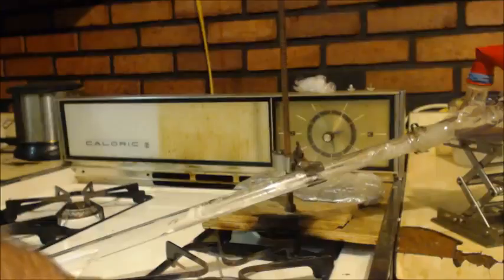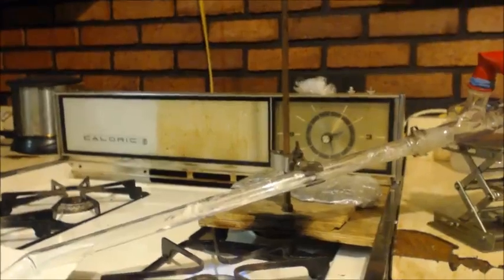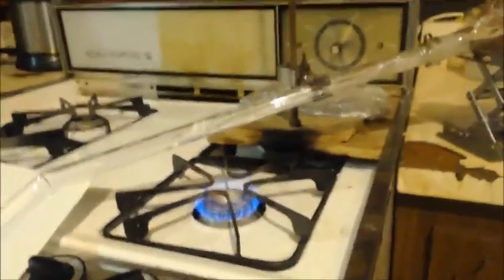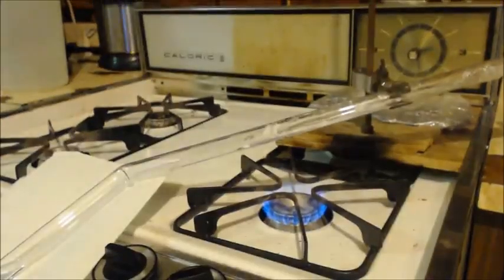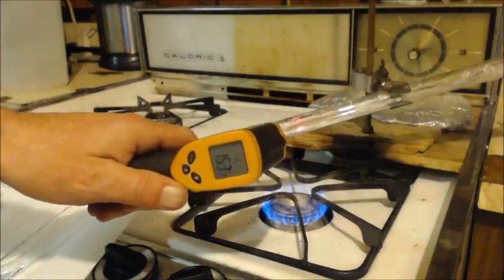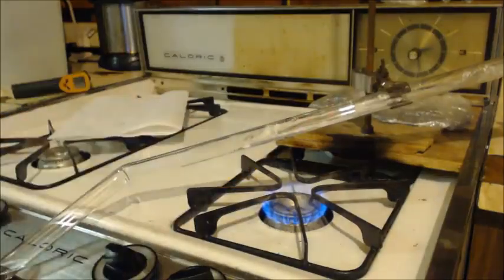And it goes into that same dealio with the graduated cylinder. It's already filled up with water. There's barely any air in there, a little bit though. Oh, you can see the flame. It's right above that catalyst. I think about 250 is when it starts being hot enough. It's almost there.